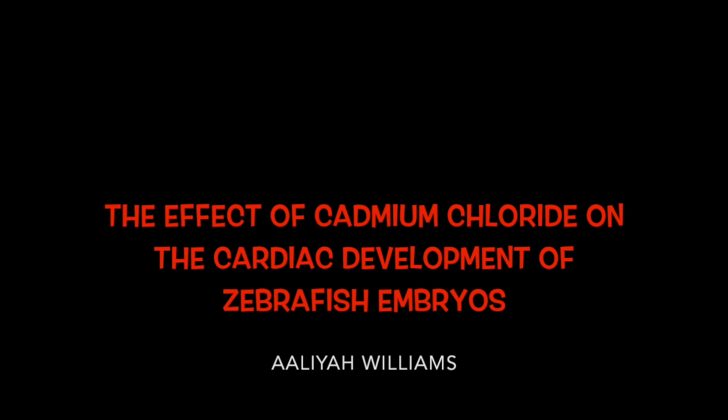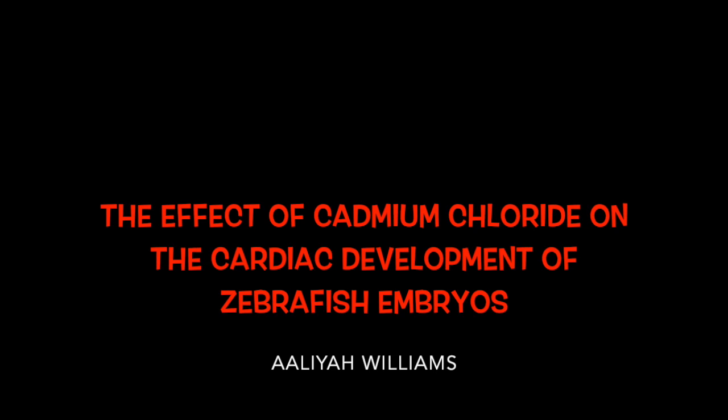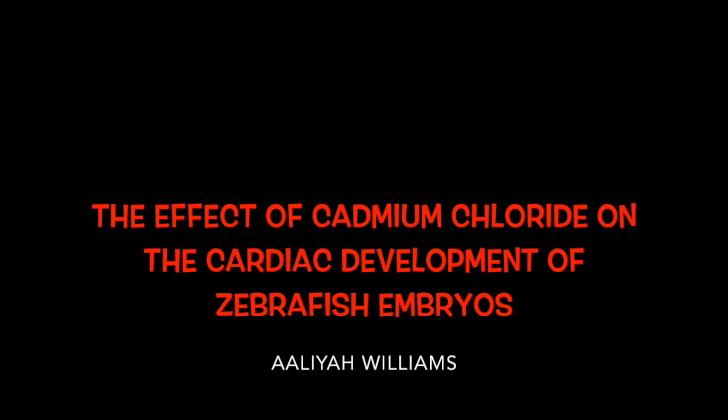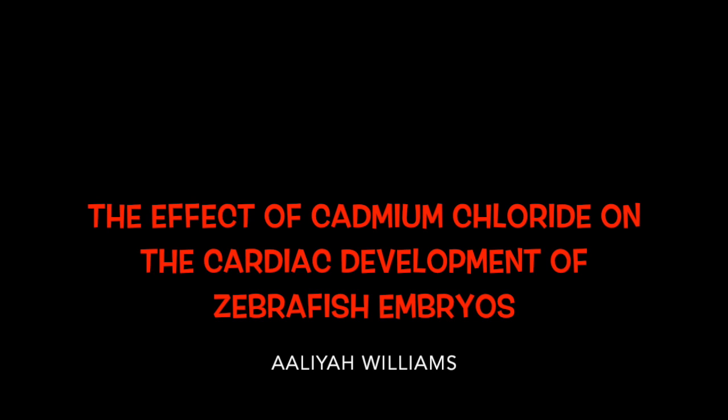My name is Aaliyah Williams, and the title of my project is The Effect of Cadmium Chloride on the Cardiac Development of Zebrafish Embryos. The purpose of my experiment is to investigate if there are morphological and functional defects of the zebrafish heart due to varying concentrations of exposure to the environmental toxicant cadmium in the early stages of development.